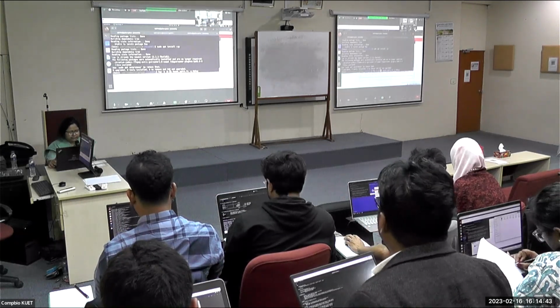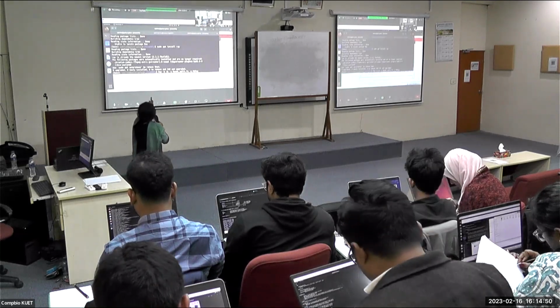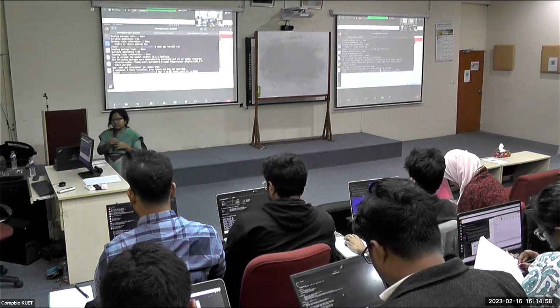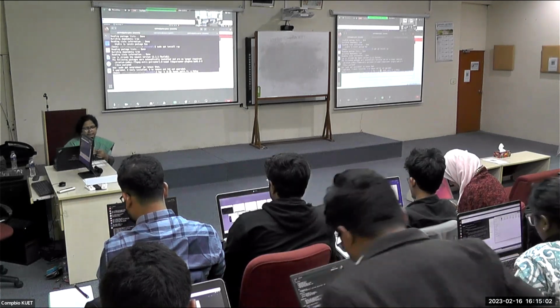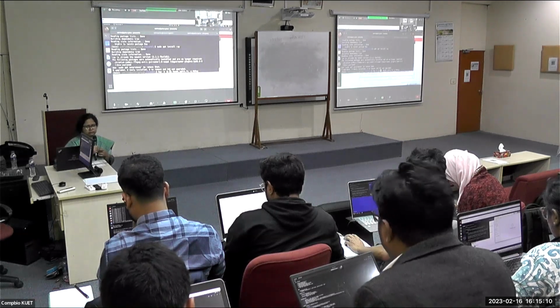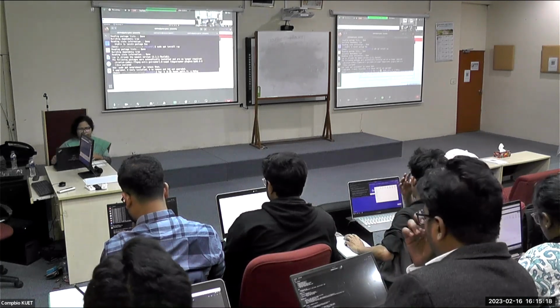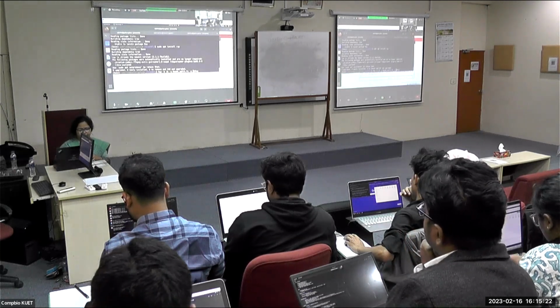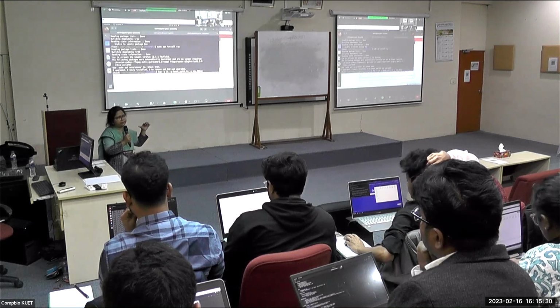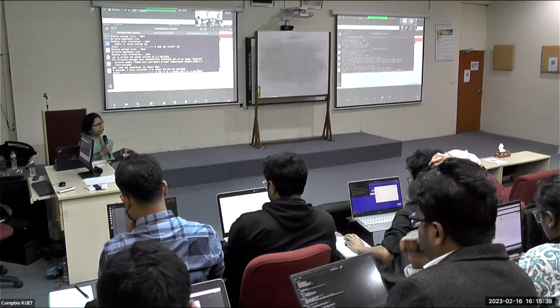Then we wrote -s, which is showing the sequence file, the reads split.fa. We copied it inside the folder, and we are now using it for assembly. This is the file where we have all the sequences that we are going to assemble. And the last one is -o, which is the output folder. You can try giving it a different name also. I will name it new_MT. MT stands for mitochondria because this is a sequence from the mitochondrial genome. And Ray is the name of the tool that we are using for assembly.